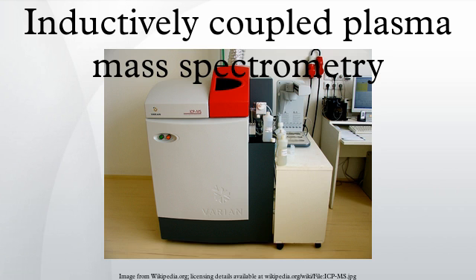Later stages have their vacuum generated by more powerful vacuum systems, most often turbomolecular pumps. Older instruments may have used oil diffusion pumps for high vacuum regions.